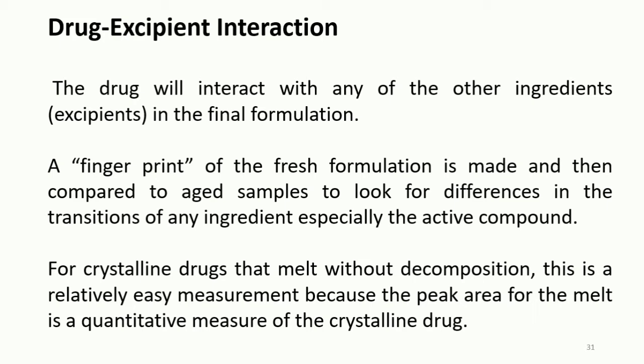So it means that the differential scanning calorimetry technique would also help us to compare the freshness of the sample.